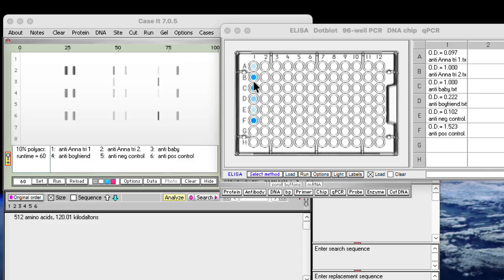In trimester 2, though, she had a higher OD value with a strong positive result for the ELISA. All 6 bands were showing for the Western. And the criteria back then was if bands 2, 4, and 6 were showing, that was considered definitive. So back then she would have definitely been considered definitive for HIV.